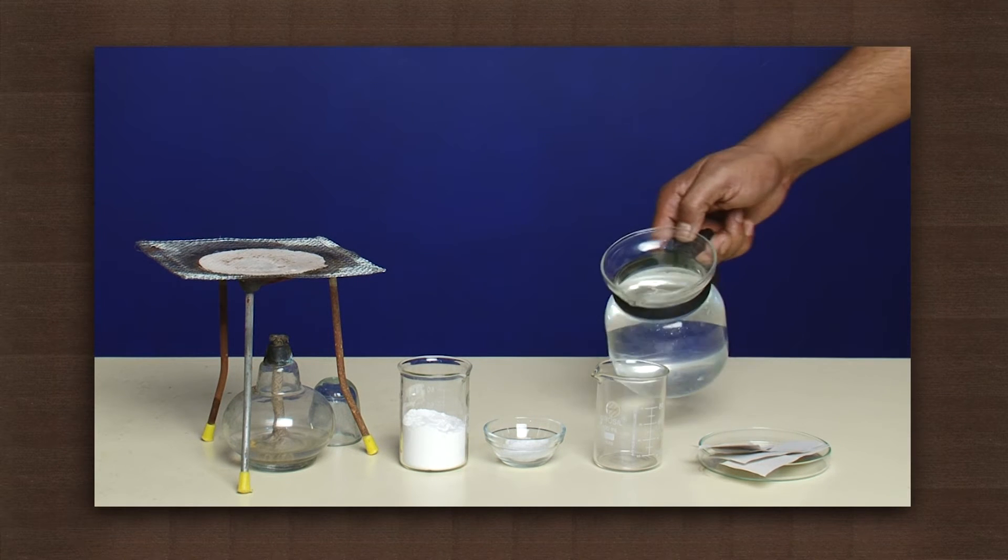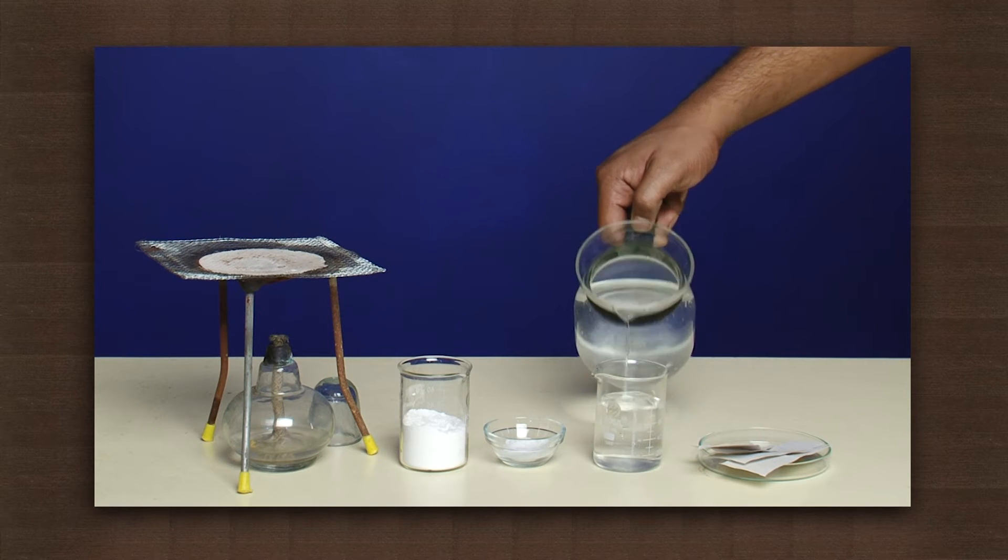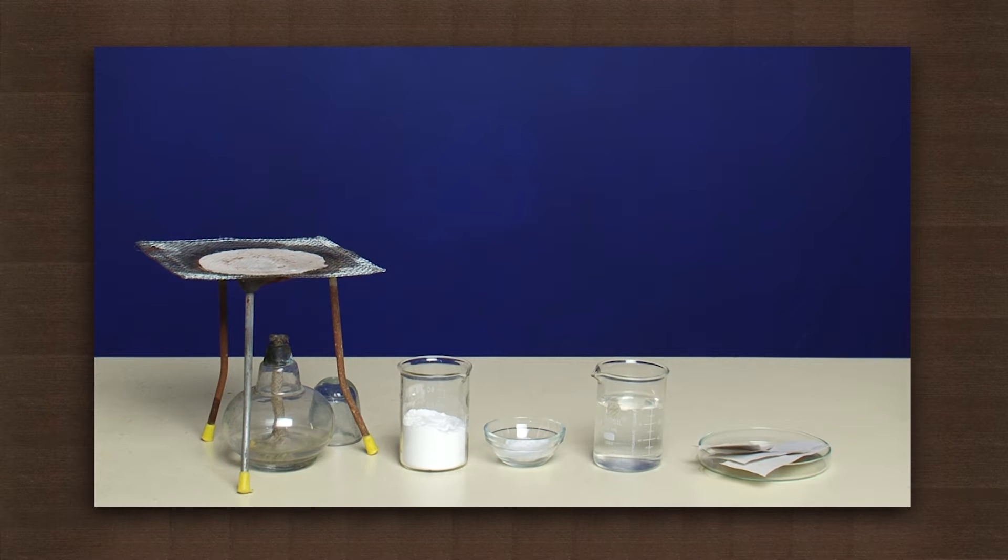Pour water in the beaker. Add two spoons of starch to it.